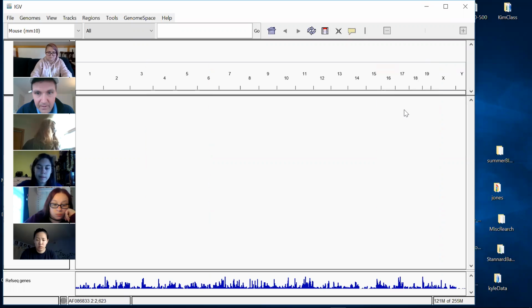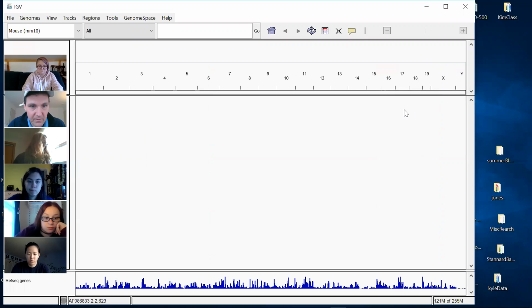I want to try something a little different as far as your responses. So if you were able to install and now have opened the IGV, can you give me a thumbs up, or what else can you do? Okay, just give me a thumbs up or some type of icon on your screen.